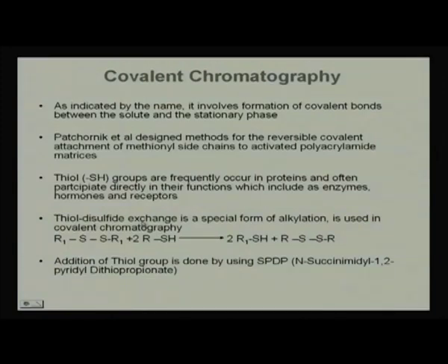Thiol disulfide exchange is a special form of alkylation which is used in covalent chromatography, and this is the reaction. You can see the addition of thiol.